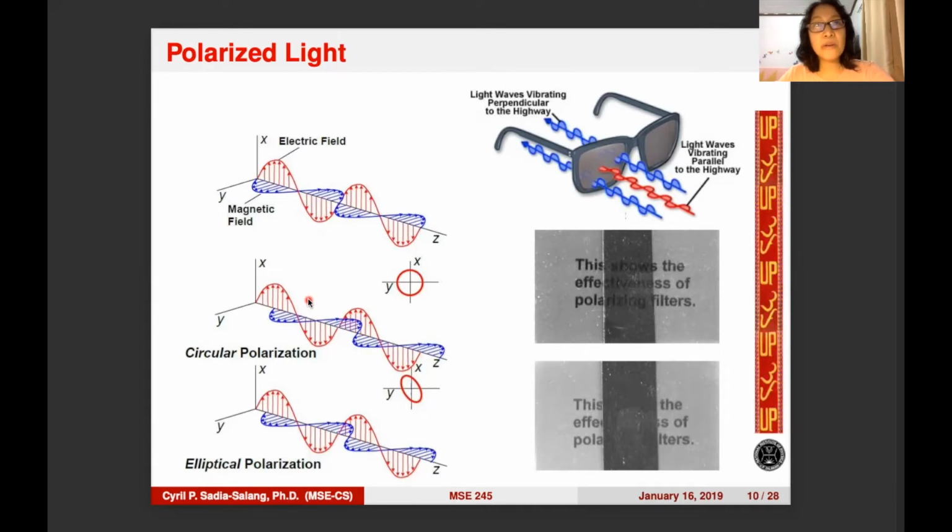However, remember that common light sources are unpolarized because there is no preferred vibrational direction for the accelerating electrons emitting the light. Recall that light is emitted radially, so imagine numerous planes of vibration. We can represent these planes by radial lines, or better yet, simply by horizontal and vertical components. We represent unpolarized light by horizontal and vertical components.